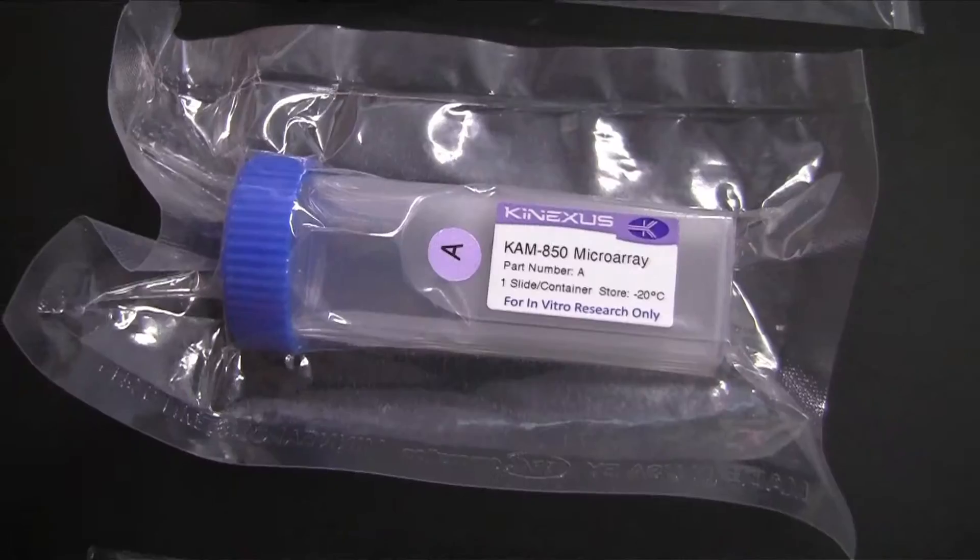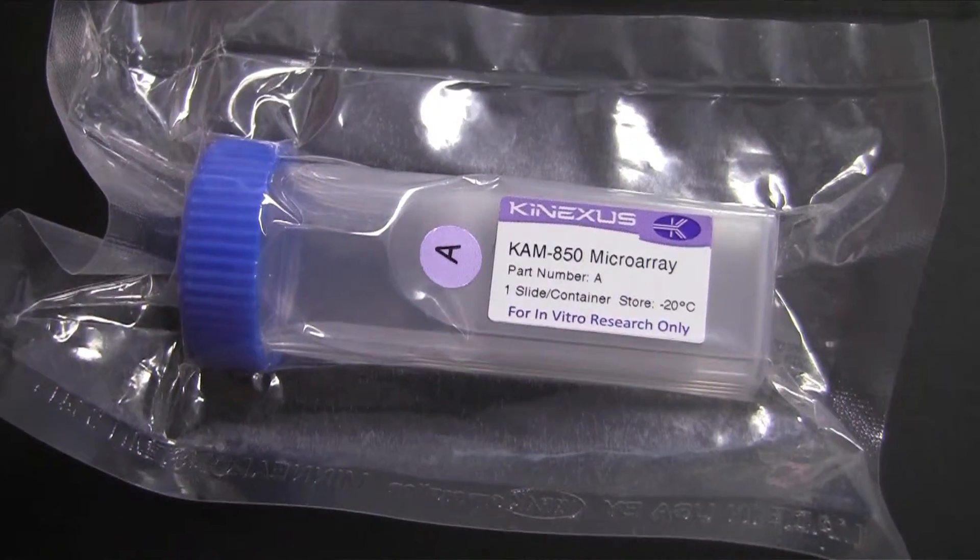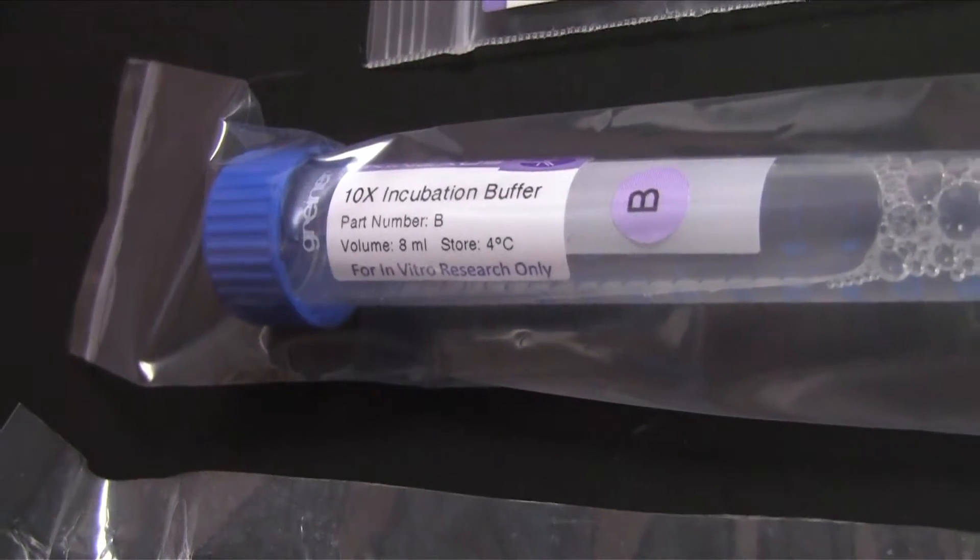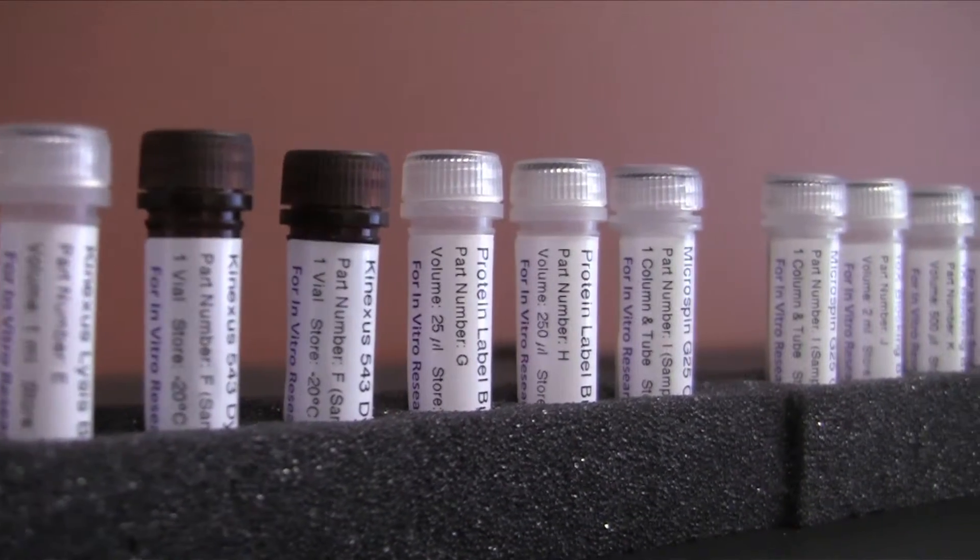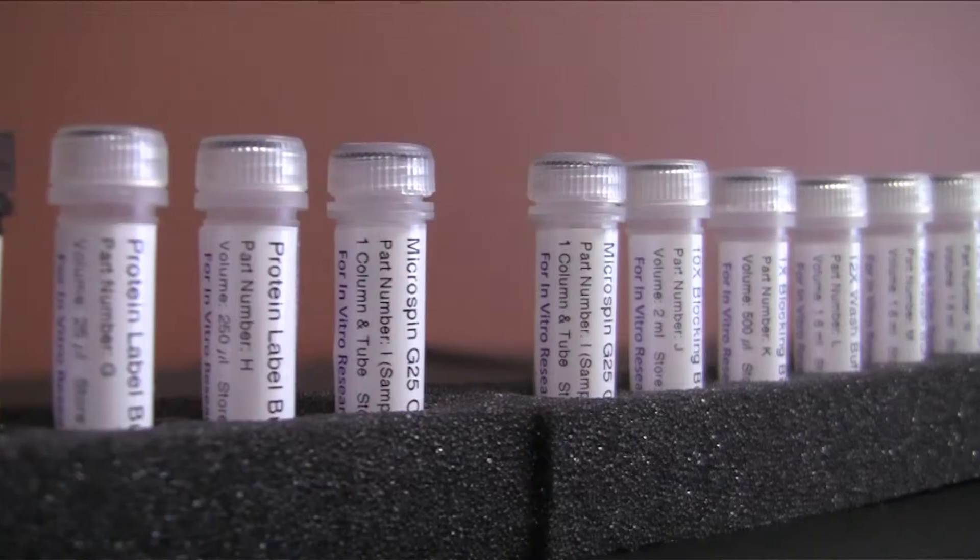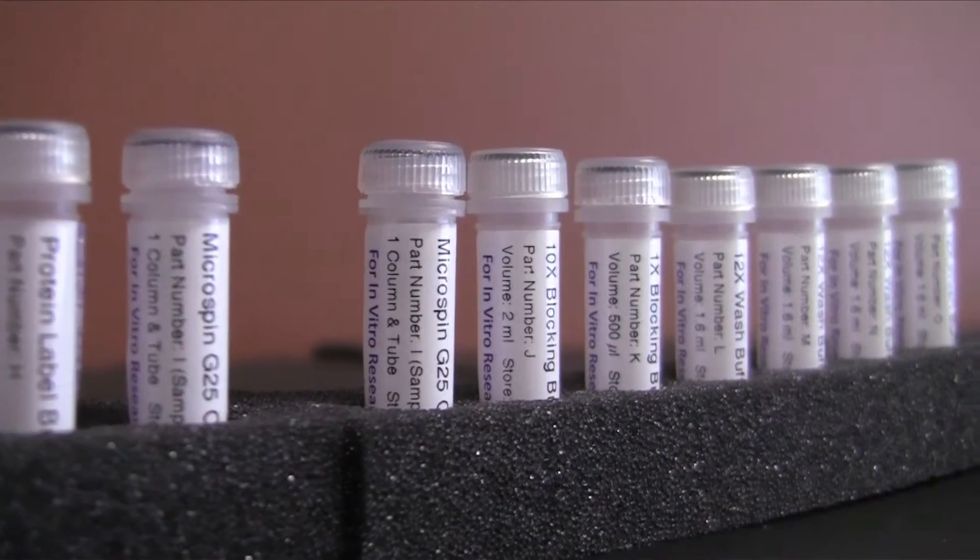These include the vacuum sealed CAM850 antibody microarray labeled with the letter A and the two fluorescent dyes labeled F which are stored in the dark colored vials. All of the other items can be stored at 4 degrees.